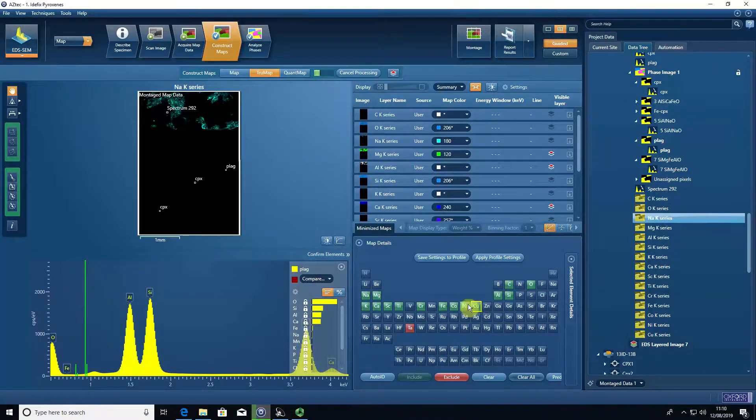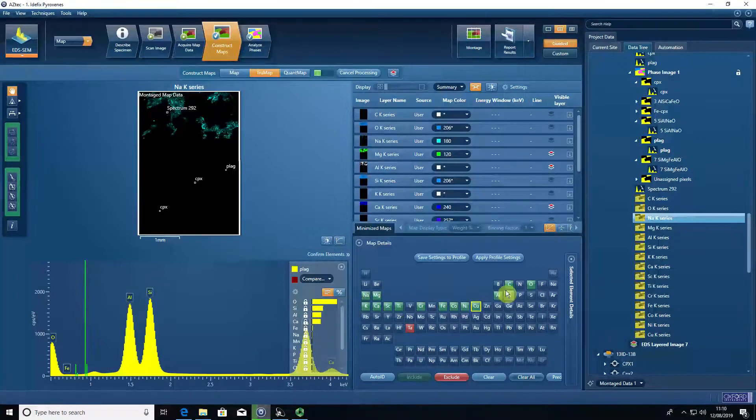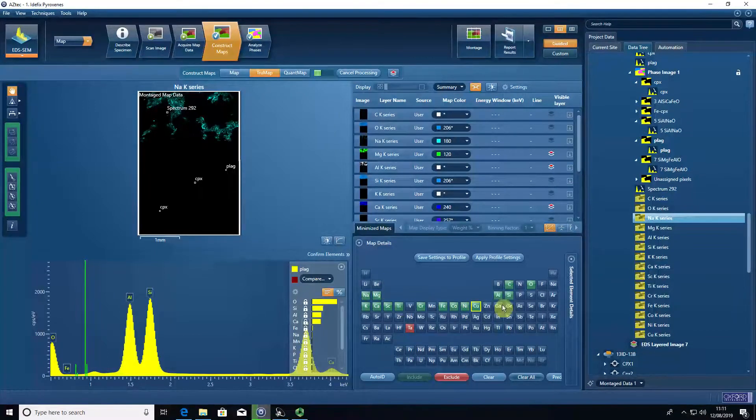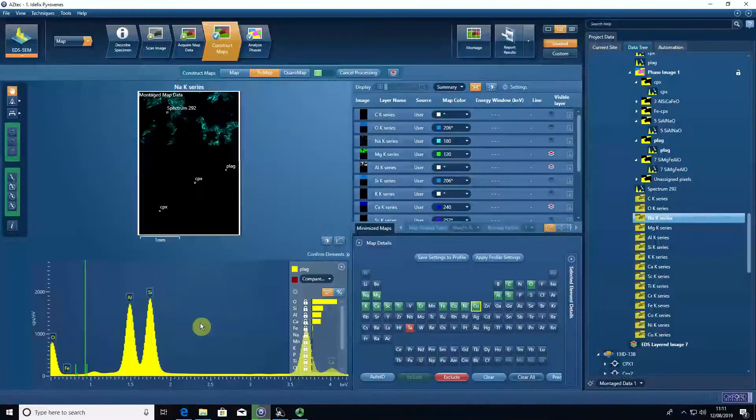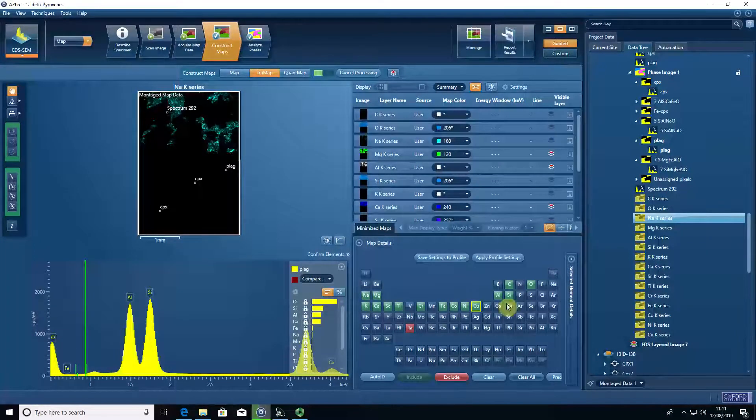The process is to acquire your maps, select the elements that you want to extract from your map data, and then true map for those elements.